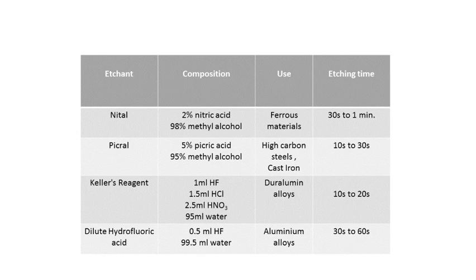Because if we do over-etching, even the inside of the grain will start reacting with the etchant, so over a period of time we cannot differentiate the grain from the grain boundary. And if we do under-etching, with a time much less than the required time for complete etching of the grain boundary, we can have certain regions where we can see the contrast, but it will not be complete.